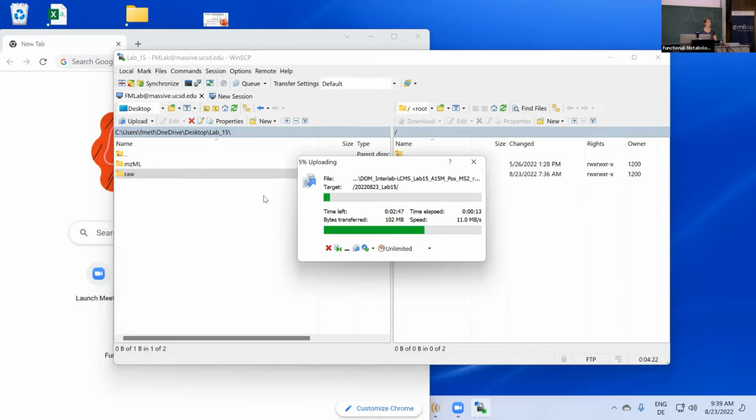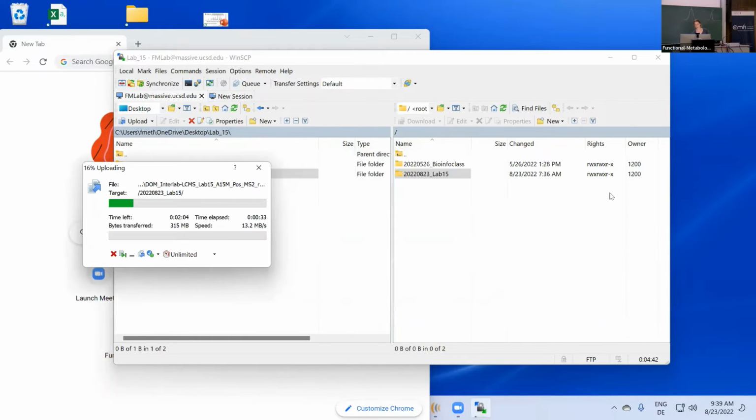But if you make it public, then that's great for us, right? Because then we can find that to contextualize it. Awesome. So that's a good point, you have to make it public because now you do have to delete stuff from your personal folder, as opposed to just dumping the raw files there.